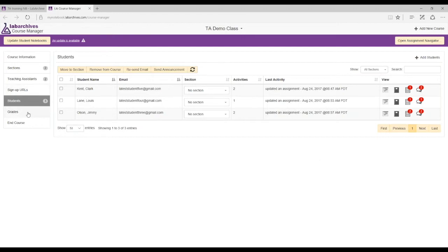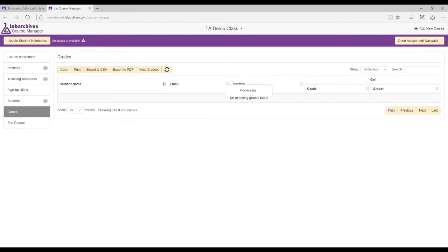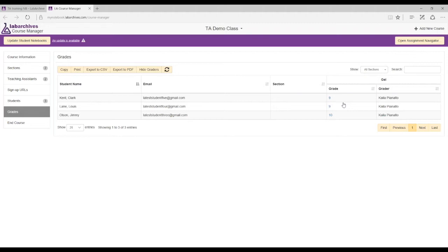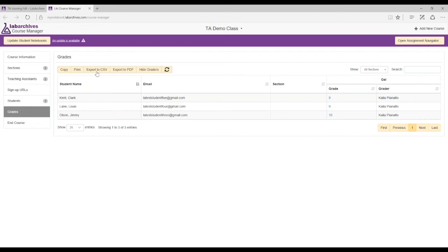Now you can see the grade report sitting there. You have options — you can copy or print it. If you're connected to a learning management system like Blackboard, Moodle, or Sakai, you can export the grade report from Lab Archives as a comma-delimited file and upload it into that system. That typically works without any problem.